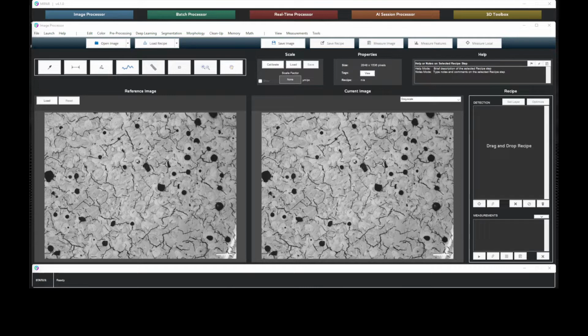When performing defect analysis in EM data, variation in feature contrast and background noise can pose challenges for an accurate automated solution. In this case, cracks and pores have very similar contrast and are often connected. Separating them can be challenging.